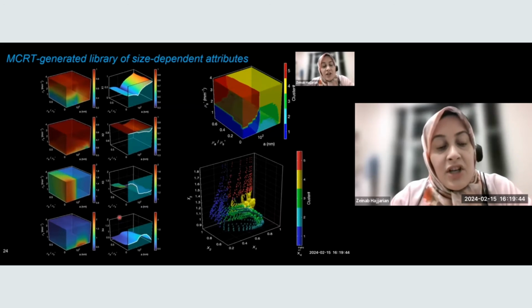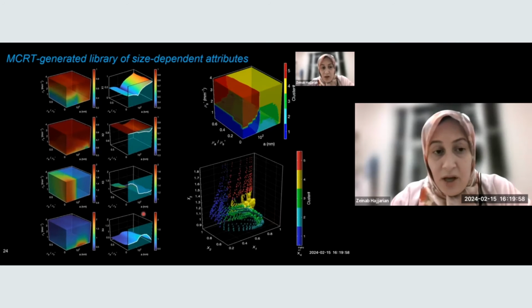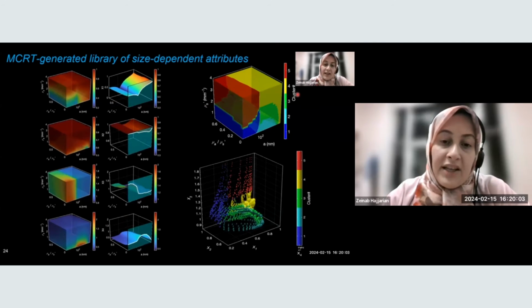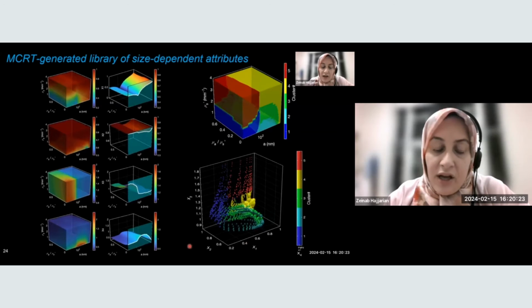And what we realized is that the relationship is pretty involved. It's not a simple linear relationship and does not warrant a simple linear regression model that allows us to predict particle size from these attributes. So we turned to a clustering approach, where we plugged these 4 attributes into a k-means clustering algorithm that divided this space for us into 5 different clusters, and for each cluster it came up with a multiple linear regression model that would give the particle size as a function of these attributes.